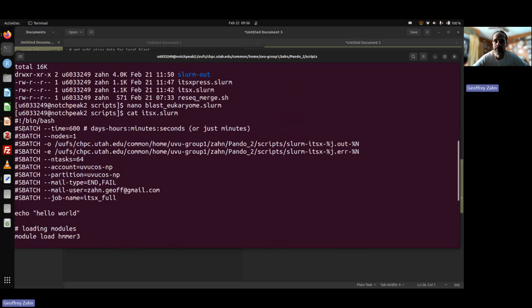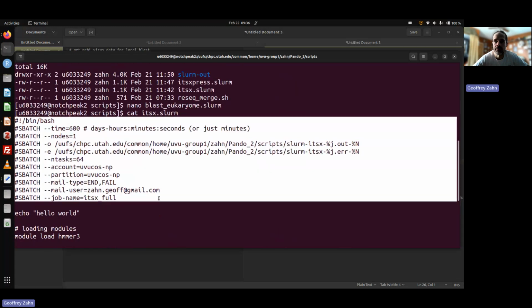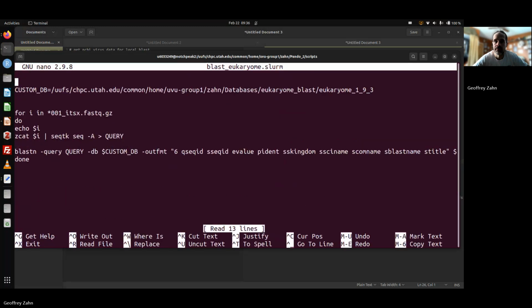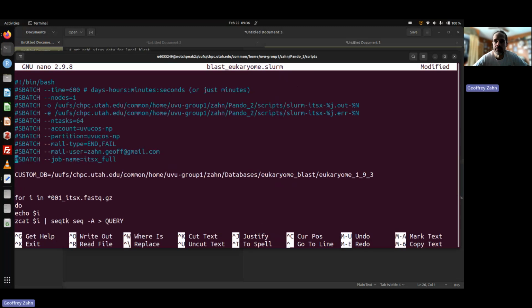We'll come in here and copy my little slurm header because I'm lazy. Okay, I am going to ask for 3 full days.